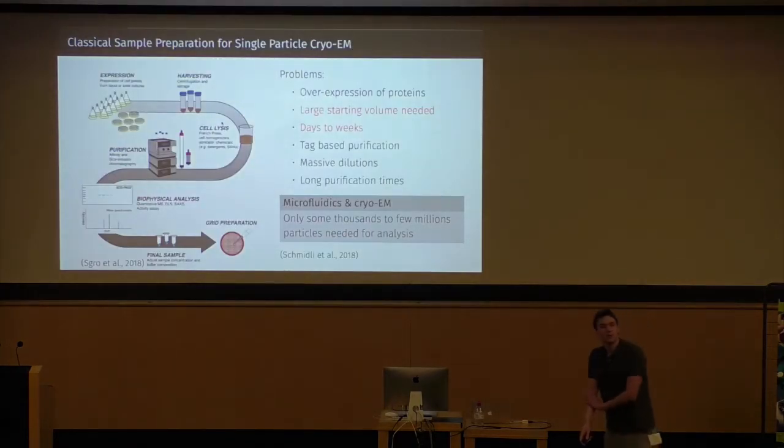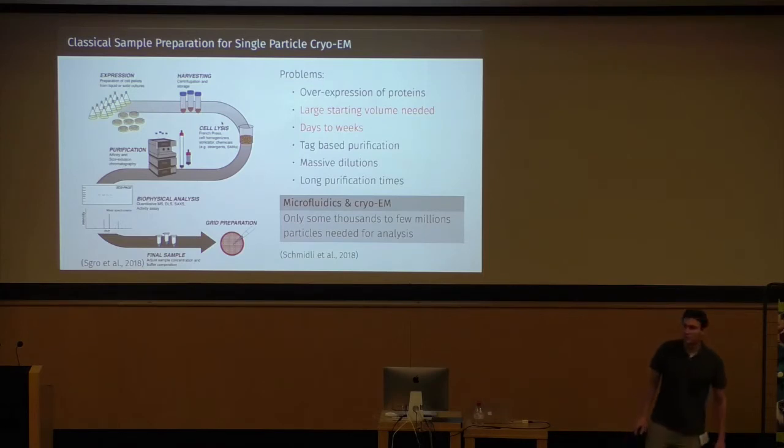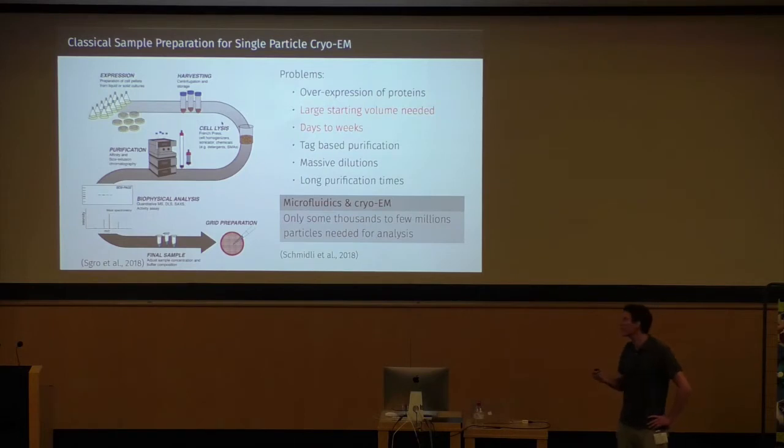Now to the purification part of the setup. Classical protein purification tends to use rather high volumes and quite a lot of time. But in the end, for structure determination, you only need several thousand to millions of particles. And this amount of protein can easily be handled by microfluidic techniques. So this classical pipeline indicated here is in principle not needed.